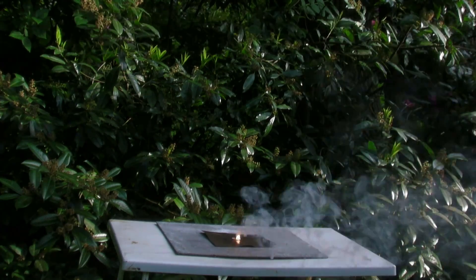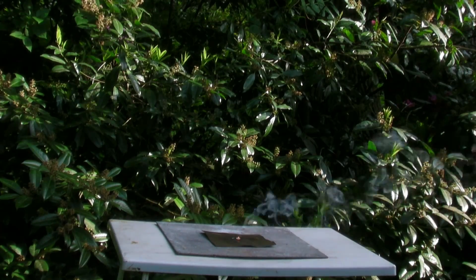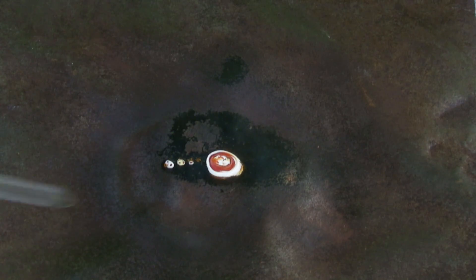At the end, the phosphorus pentoxide forms a layer that keeps the phosphorus from burning completely. So it is possible that it reignites when touched.